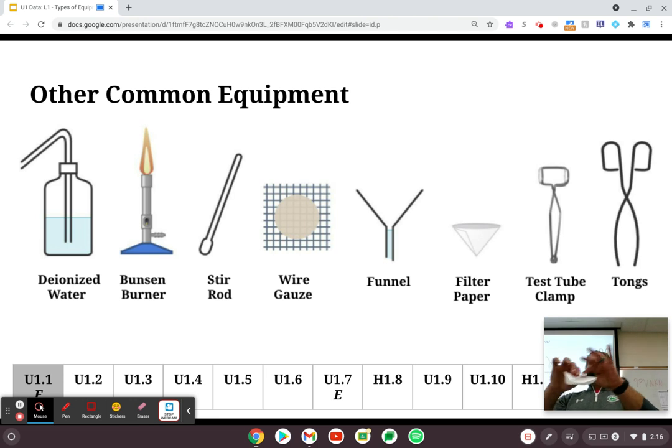So if I take a circle and I make it into a taco and I make it into a slice of pizza and then I open it up just right, I get an ice cream cone. And if I take that ice cream cone and stick it into my funnel, I can now filter out stuff and collect something on the bottom.